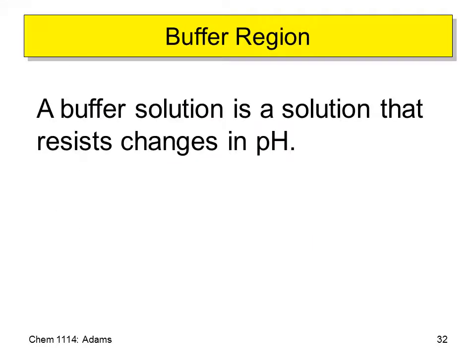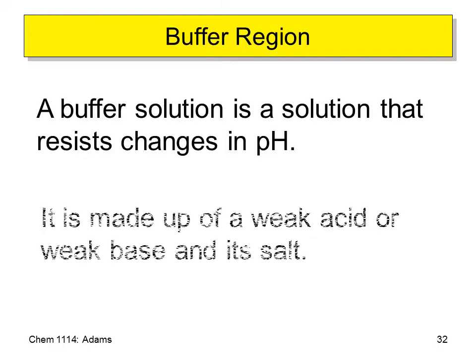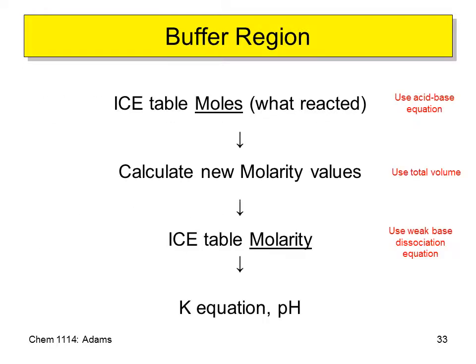Again, this is a repeat of a previous slide. A buffer is a solution that changes very little pH-wise when you add a lot of the titrant. And here it's going to be made up of a weak base and its salt. You have seen this slide twice already. Again, we're using the same methodology.